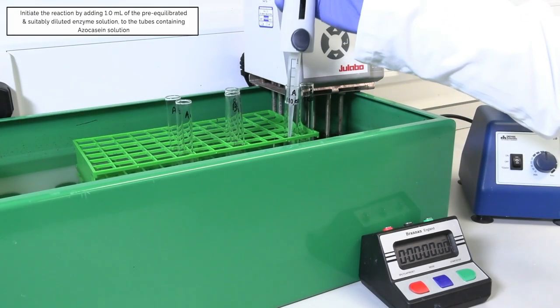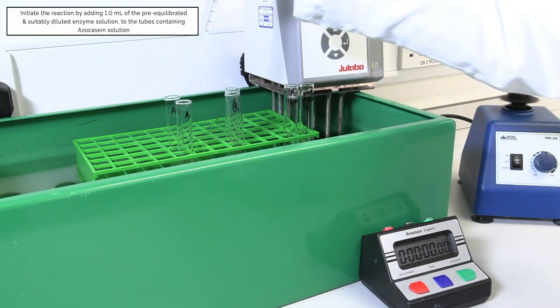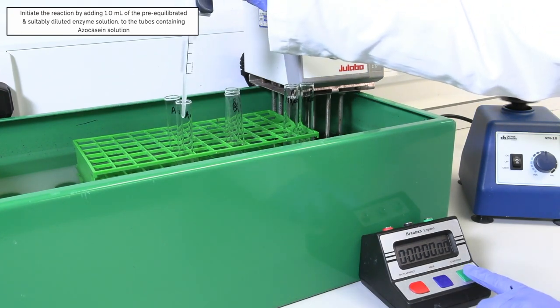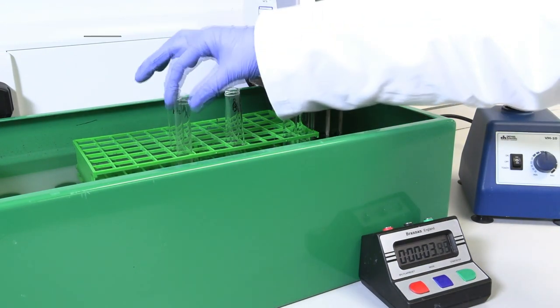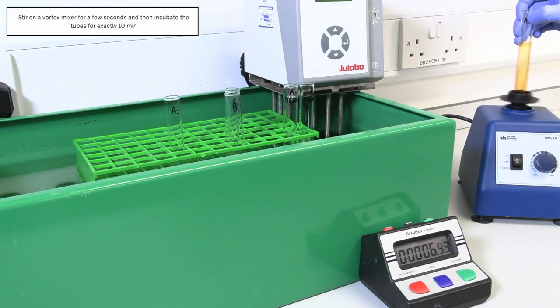Initiate the reaction by adding 1 ml of the pre-equilibrated and suitably diluted enzyme solution to the tubes containing azo casein solution. Stir on a vortex mixer for a few seconds and then incubate the tubes for exactly 10 minutes.